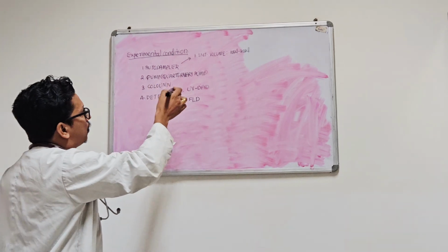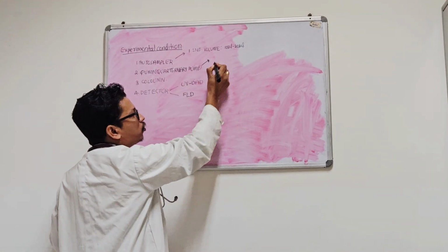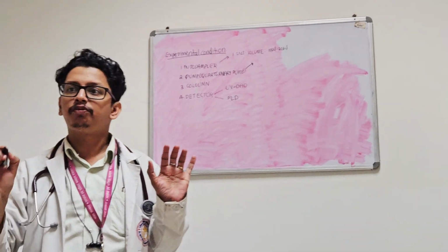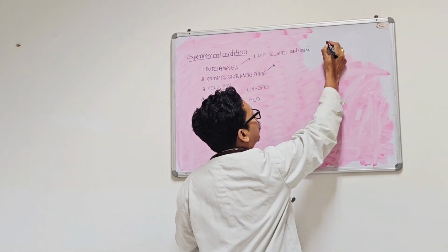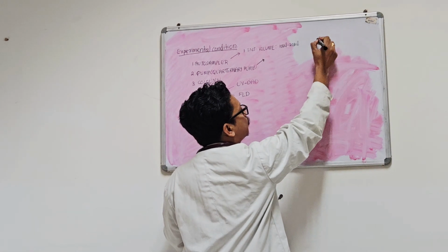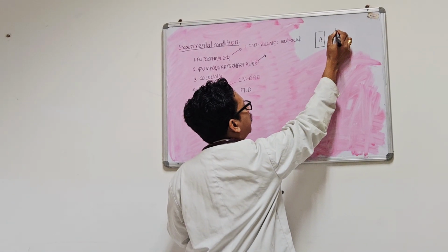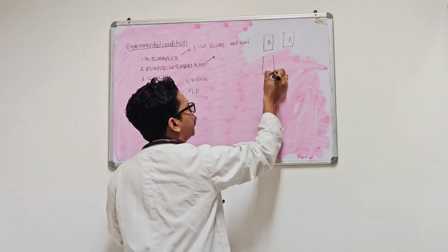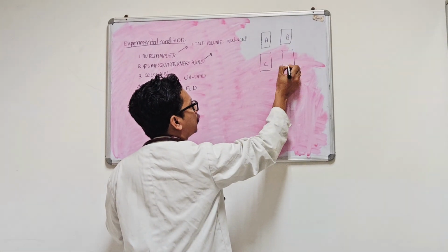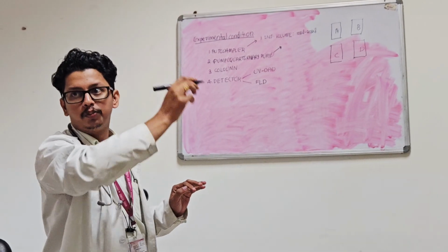Then the next part is the quaternary pump. Quaternary pump means it will take four different bottles, A, B, C, D. Inside the top of the HPLC there will be a bottle A, a bottle B, a bottle C, and a bottle D. Each bottle is connected to the quaternary pump via tubing.